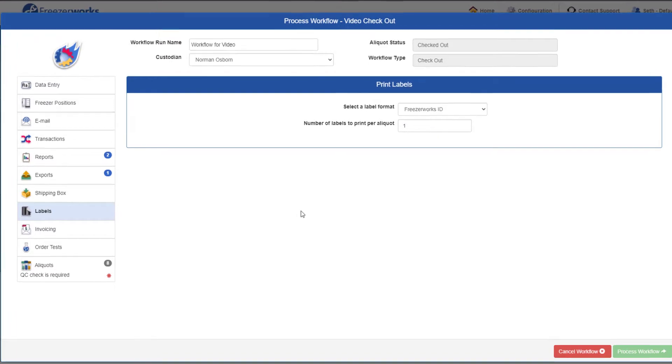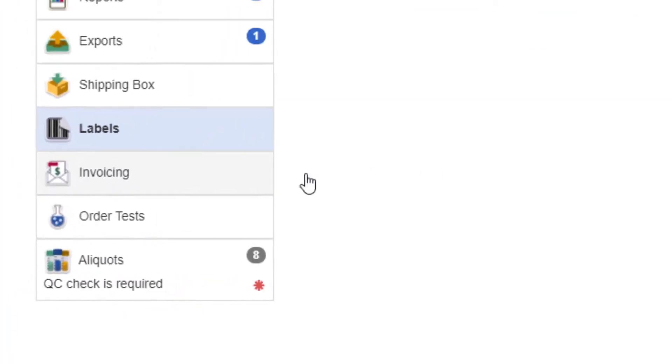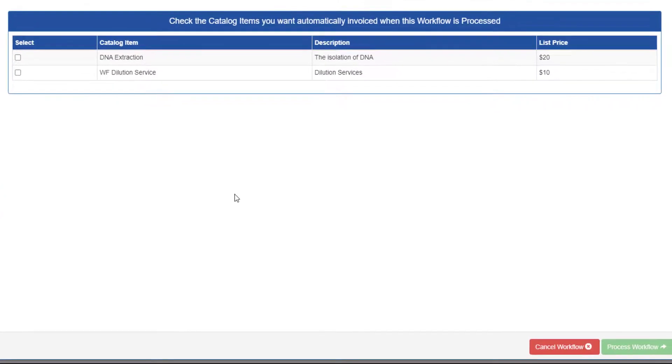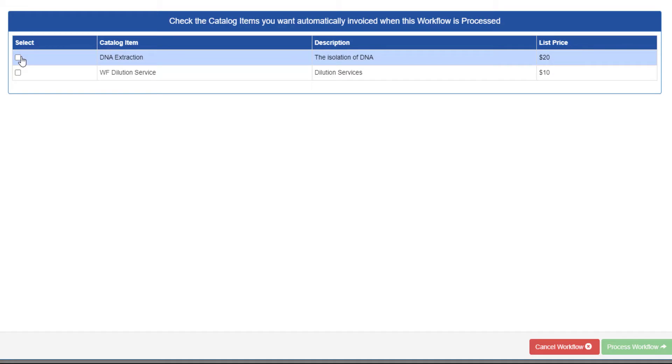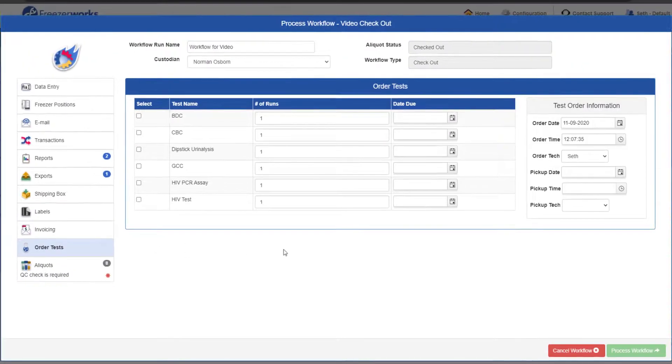Now, if you are using Summit or Pinnacle, you may also see the order tests and invoicing pages. For invoicing, simply check the catalog items you want charged for all the aliquots you're processing. However, aliquots must already be associated with a customer in order for workflow charges to appear on an invoice.